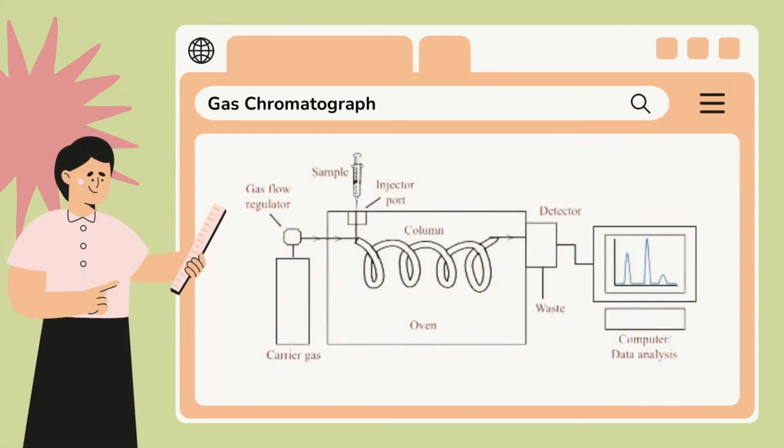In gas chromatography, the analyte is injected into the gas chromatograph and enters a gas stream which transports the sample into a separation tube known as the column. The components are separated in this tube. The detector measures the quantity of the components that exit the column. To measure a sample with an unknown concentration, a standard sample with a known concentration is injected into the chromatograph. The standard sample peak retention time and area are compared to the analyte to calculate the concentration.